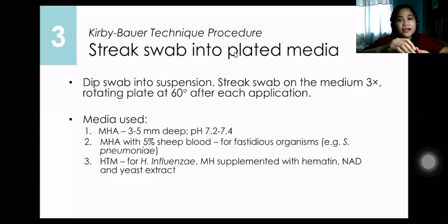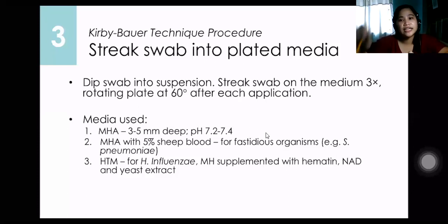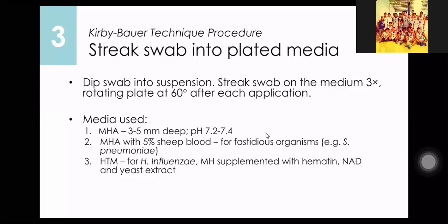Clean. Okay, so how will we put our microorganism? Okay, so we dip the swab into the 0.5 McFarland standard nga ginhimo naton nga inoculum and then i-streak naton siya. Diri na lang. To circle.